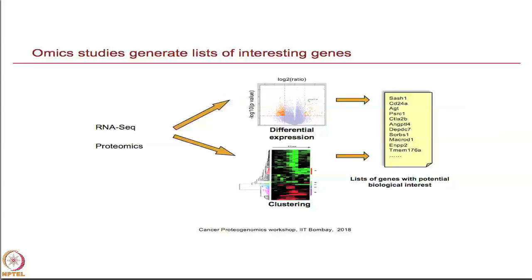For WebGestalt, this was actually my first bioinformatics project, a tool I created when I was a postdoc. The motivation is that when you do RNA-seq or proteomics, these high-throughput technologies, actually when I started this, I was doing microarray at that time. Usually you need to do differential expression analysis and clustering analysis, right? Eventually you end up with a list of genes of possible interest, like a list of differentially expressed genes, or through clustering analysis introduced by Dr. Manny during the previous lectures. You are going to get clusters of genes that have similar expression patterns, and you want to explore those genes.